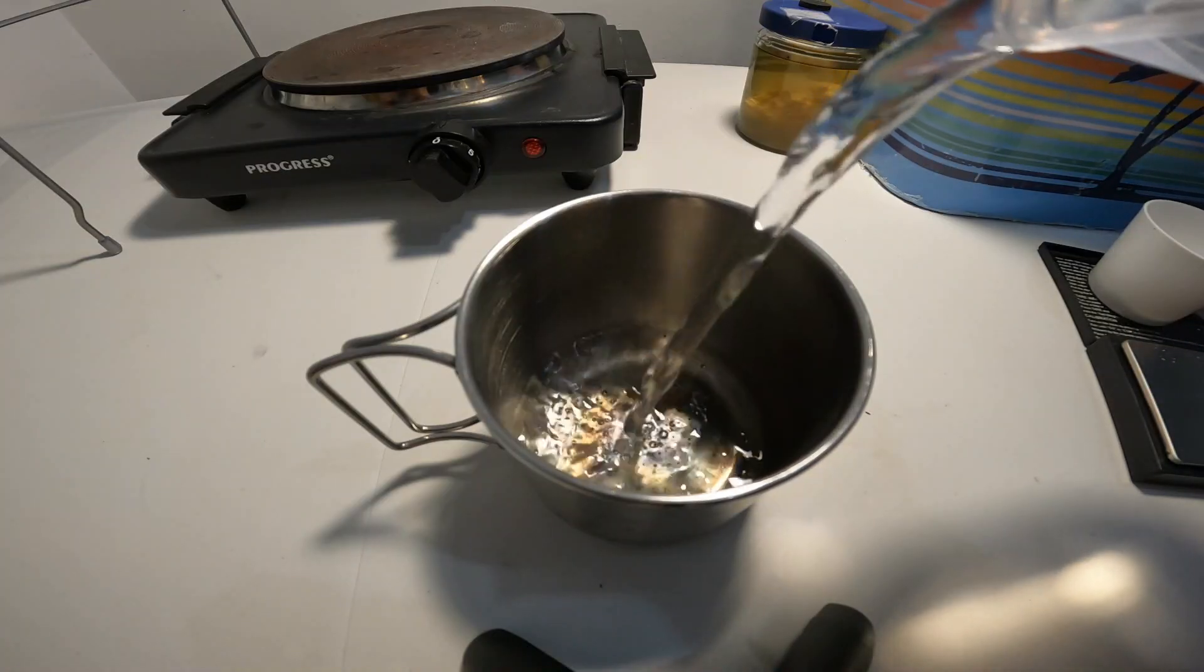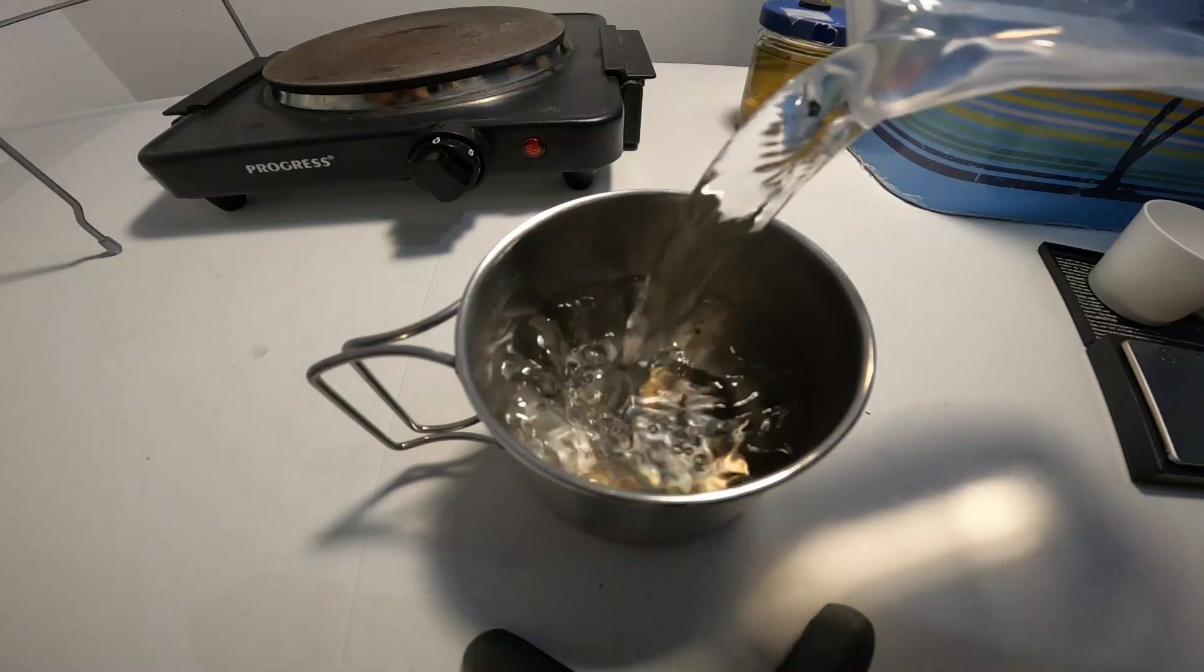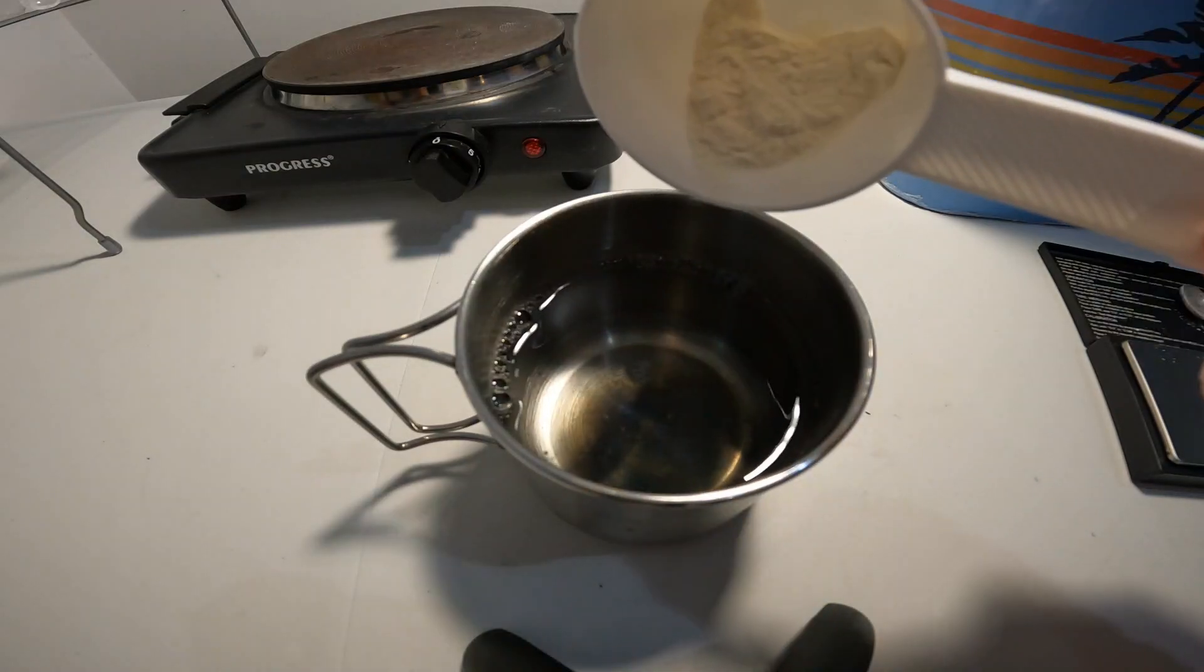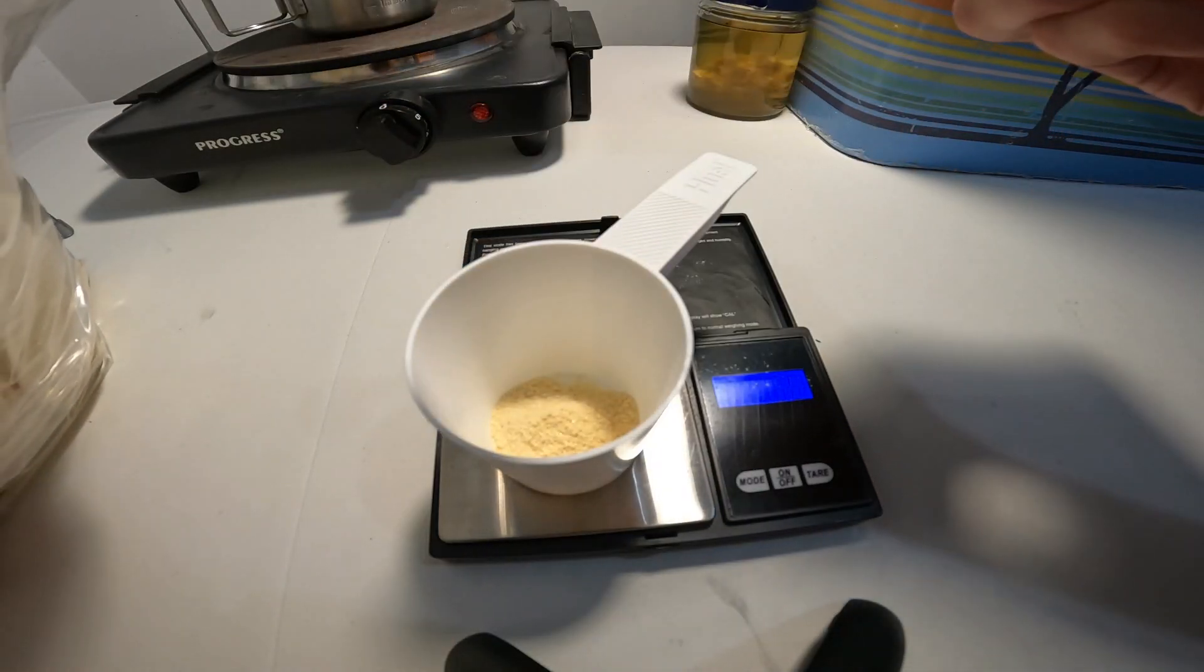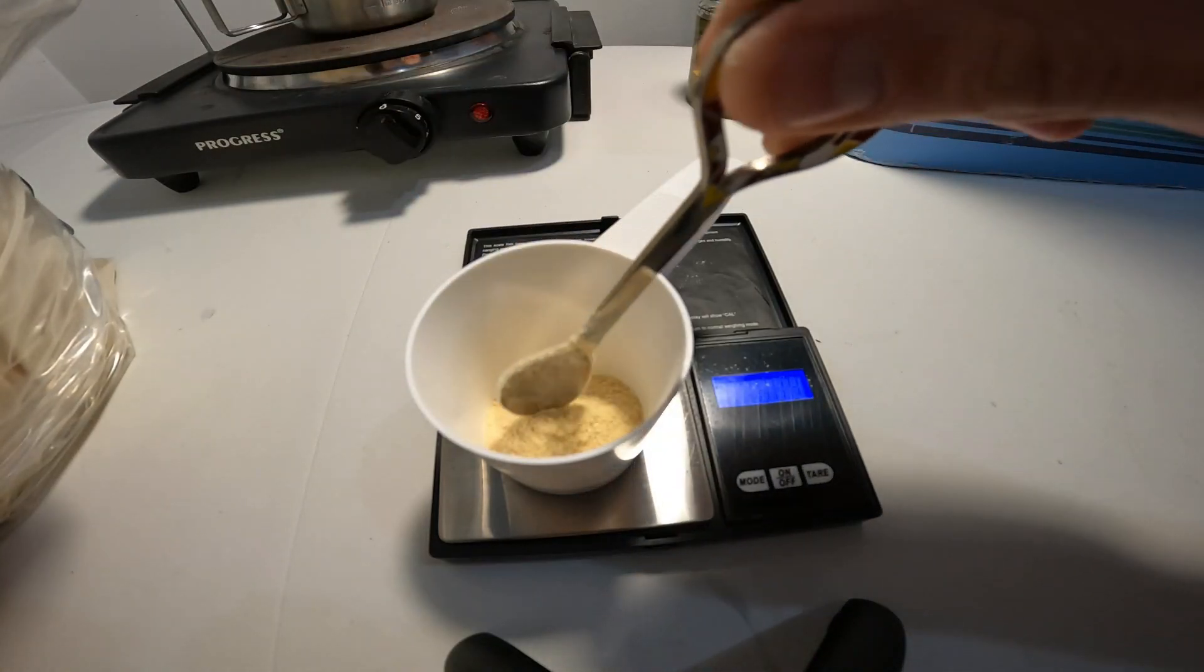This was then transferred to a stainless steel cup that I could use on the hob. I added the agar powder to the water, then measured out the light malt extract and also added that to the water.